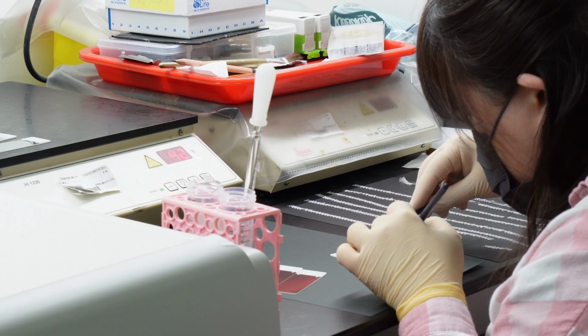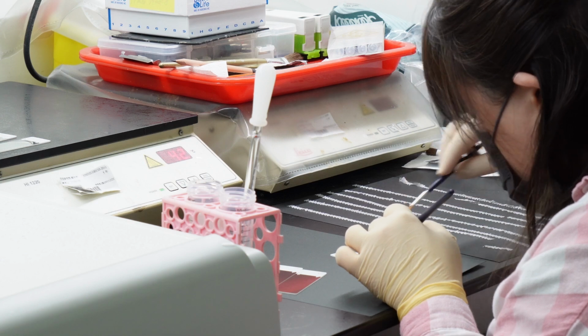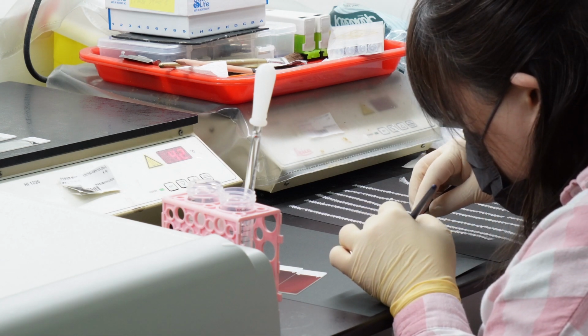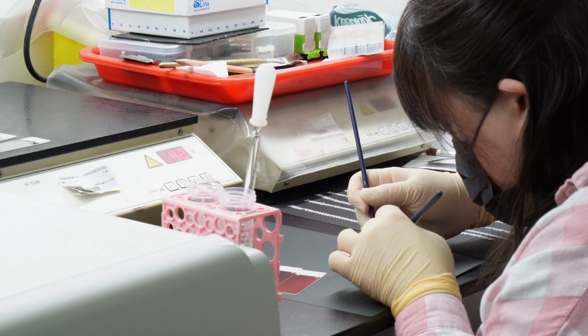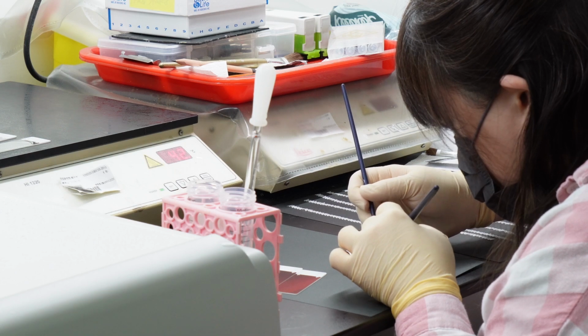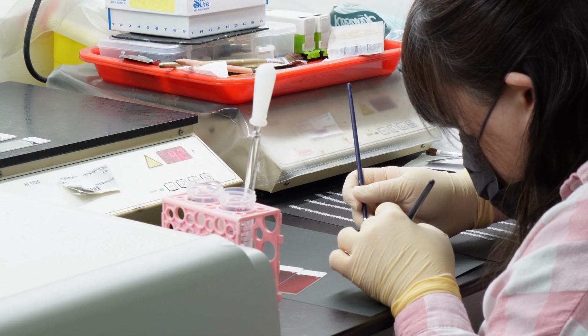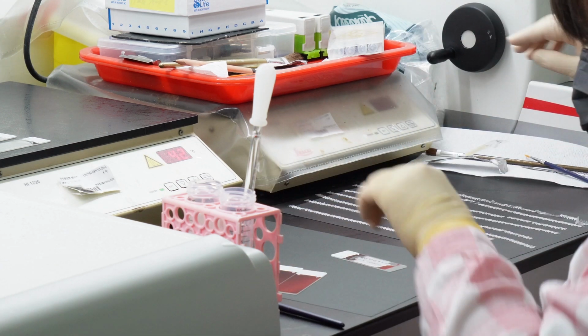Ideally, yes. As the blade cuts each section, the heat and maybe a bit of static electricity make the edge of one slice stick to the next one cut, forming a continuous ribbon of sections. Exactly. Getting a nice, long, smooth ribbon is a sign of good technique. And it's useful because having the sections in order helps you trace structures from one slice to the next. Understood, that continuity. Okay, these delicate ribbons of wax and tissue, how do they end up on a glass slide?